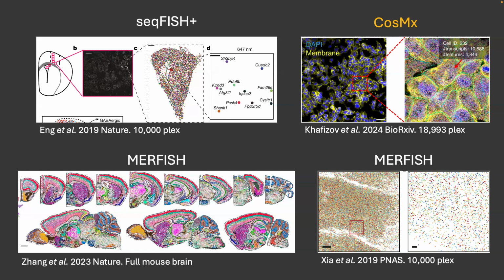Of course, if you're working with these datasets, the commercial platforms are way behind this. They do 500, maybe a few thousand max. But it's likely that it will get there.